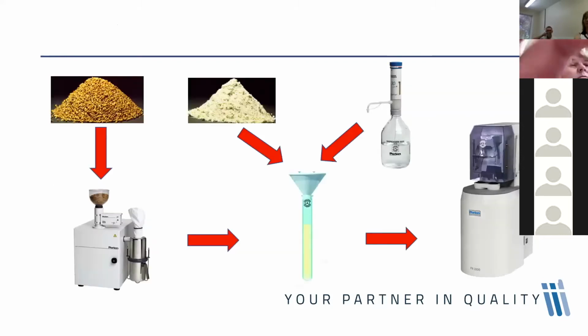So in terms of the equipment that is required, if you are handling grain, you need a lab mill, which needs to be in appropriate working condition, and also be able to give you a ground material that is compliant with the method.